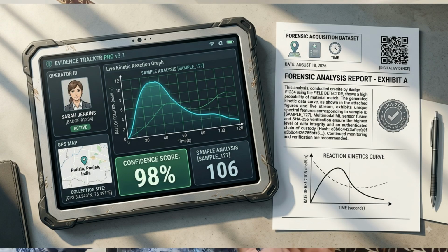So our system essentially becomes: you took the sample, added the reagent, and the AS7341 sensor and camera sense it. That's our sensing layer. It goes into the Raspberry Pi 4, and from there reaction kinetics, computer vision and ML do their work, and there you are getting a preliminary interpretation, and then we are forming a completely digital record. The final digital record can contain the relevant information and evidence associated with the test, including the sample information, reagent used, sensor and camera observations, reaction data, timestamps, and other relevant metadata. And all of that has to be cryptographically hashed. We have to attach geo tags to it as well.